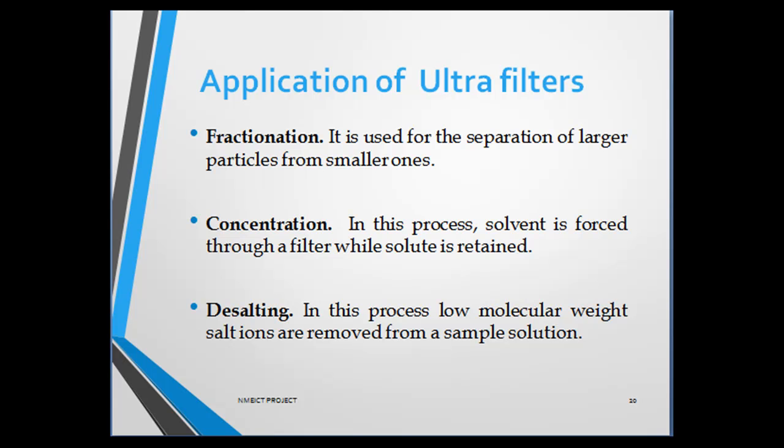The third application is desalting. In this process, low molecular weight salt ions are removed from a sample solution. Ultrafiltration is a simple method to remove salt because the ions readily penetrate the membrane, thus leaving the solute of interest on the membrane surface. Ultrafilters are also ideal for the removal or exchange of sugar, non-aqueous solvents, the separation of protein-bound ligands, the removal of material of low molecular weight, or the rapid change of the ionic or pH environment.